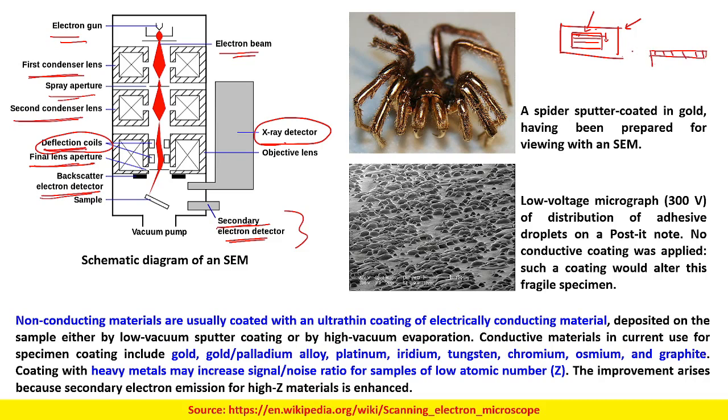The first array is taken within the field of view, then the second array of pixels within the image is captured, then you take the third one, and in that way you scan this area of your interest, so that you get a total image of your field of view. So in this way we go for this.